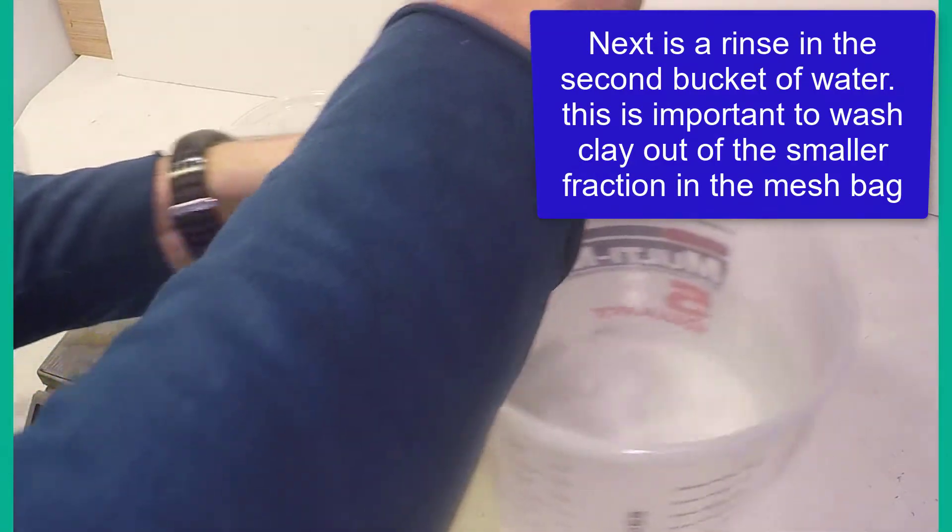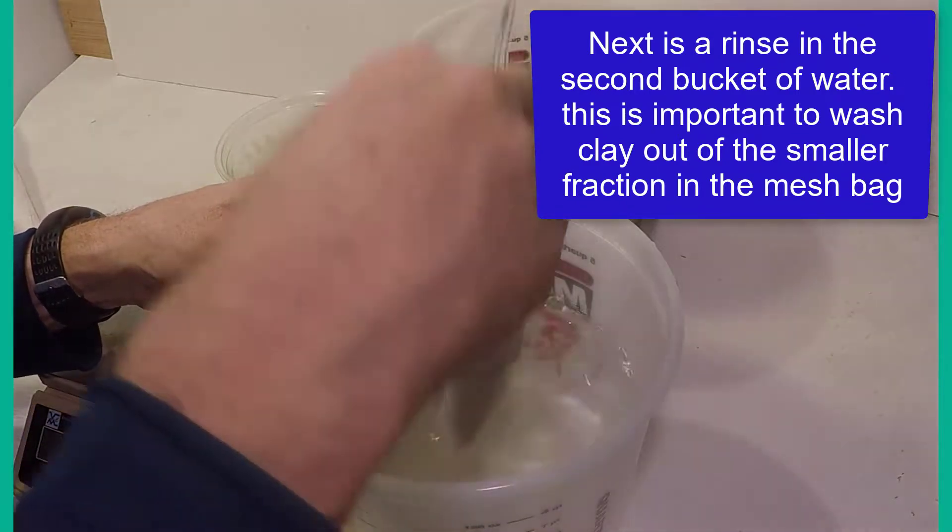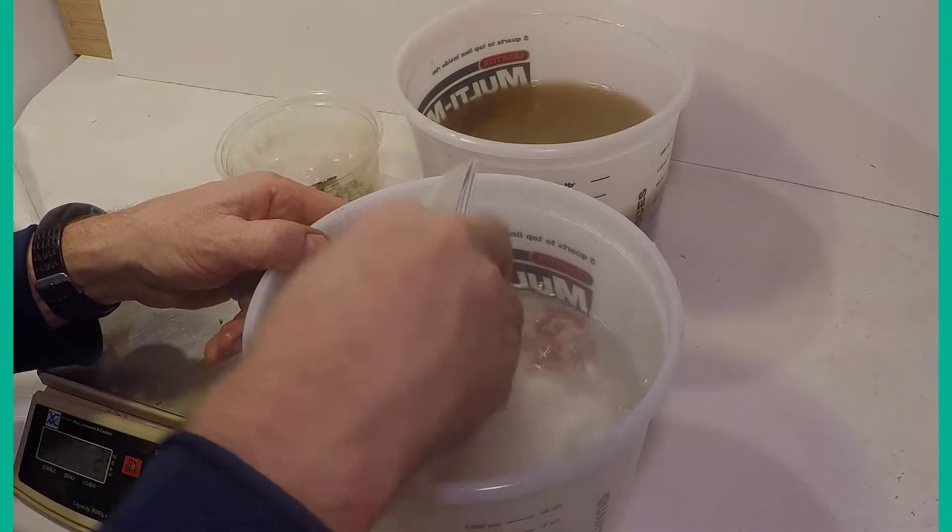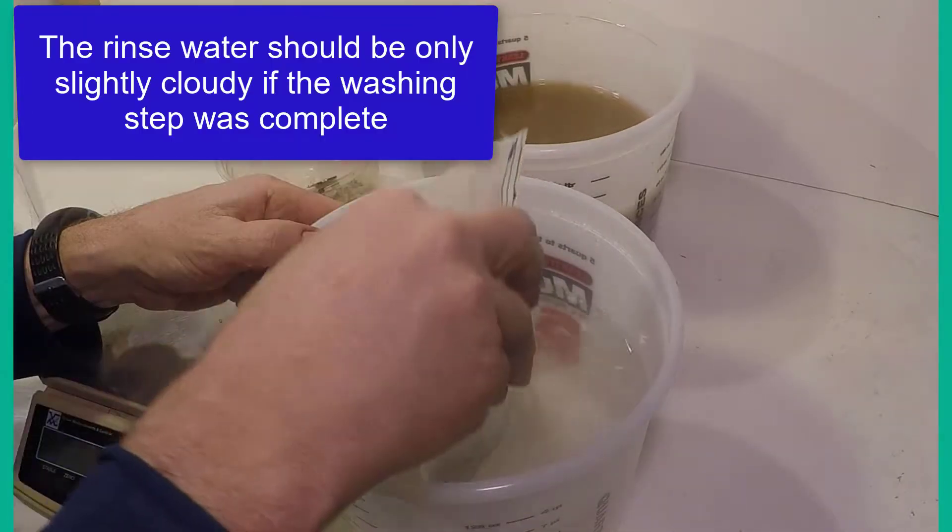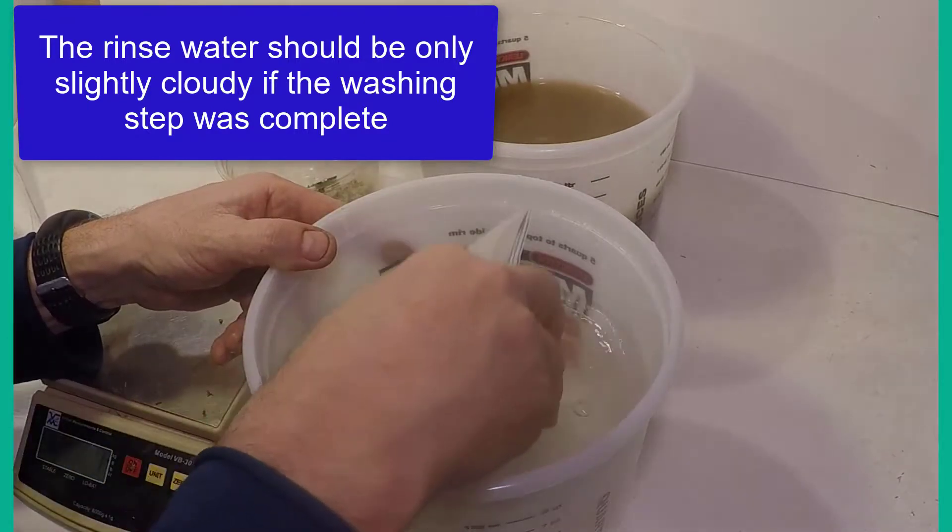After you are satisfied with the washing, the bottle and bag combination is rinsed in the second bucket. You should see only slight cloudiness released into the water, and should also see that the mesh bag now contains only sand and particles of organic matter.